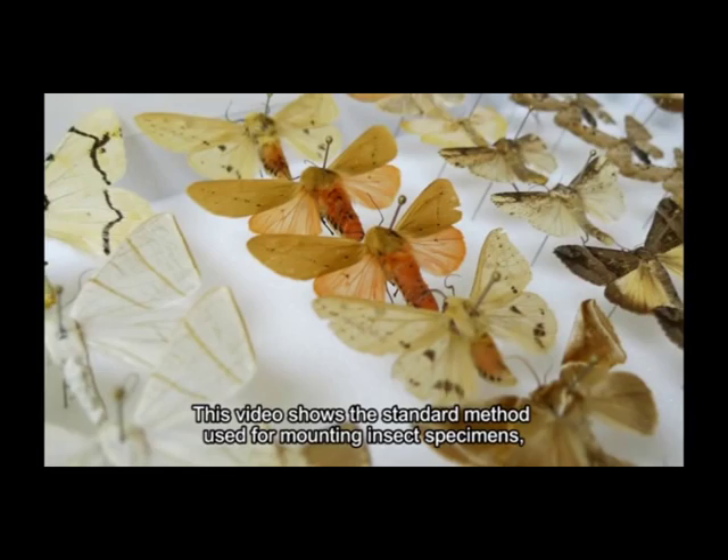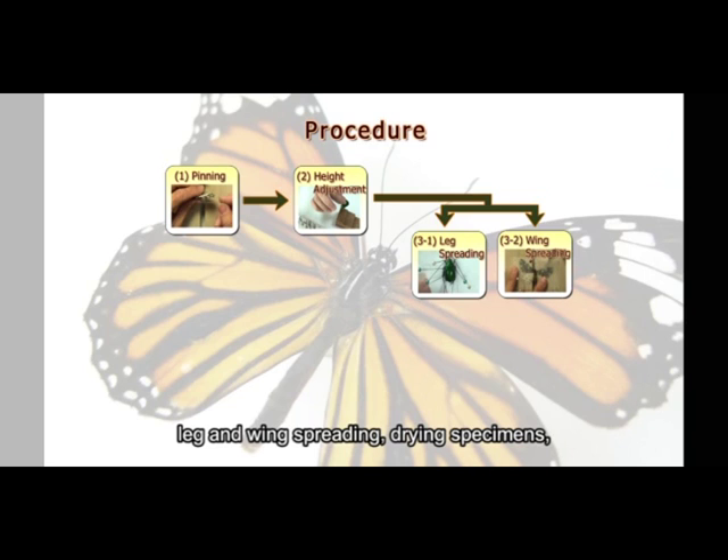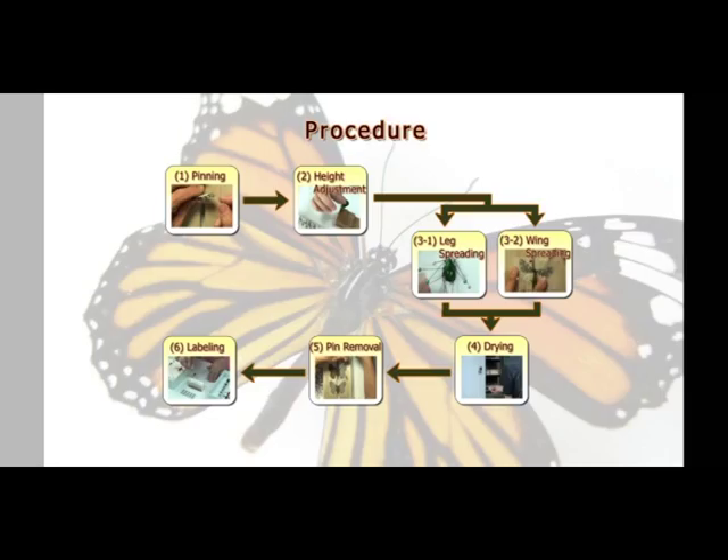This video shows the standard method used for mounting insect specimens and includes an introduction to the equipment and tools required for mounting, and the skills and processes of pinning, height adjustment, leg and wing spreading, drying specimens, pin removal, and labeling.